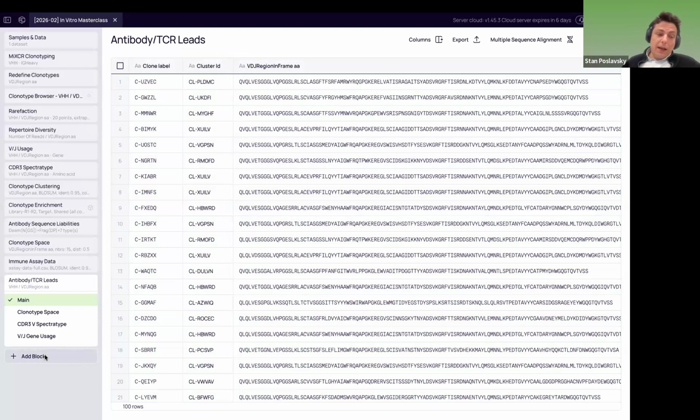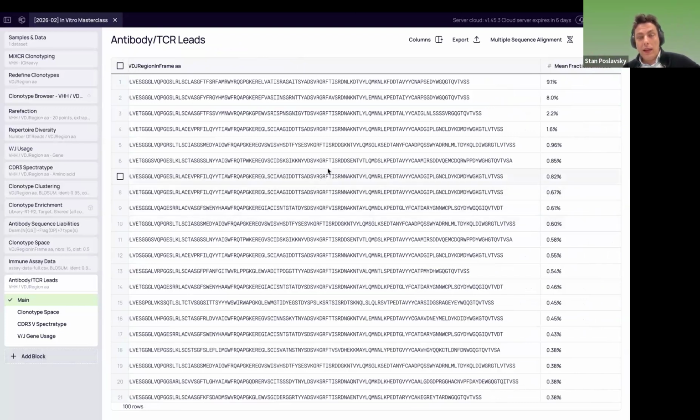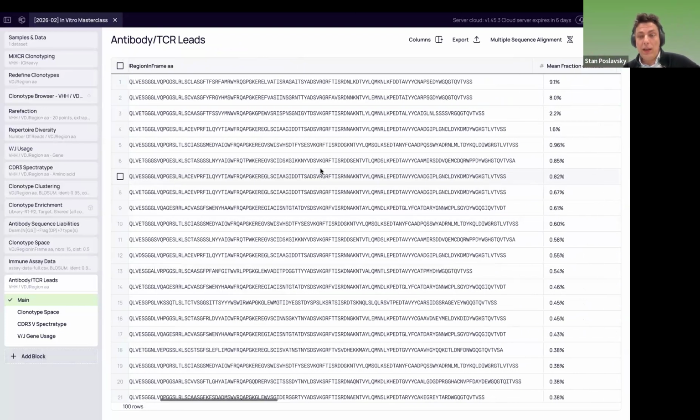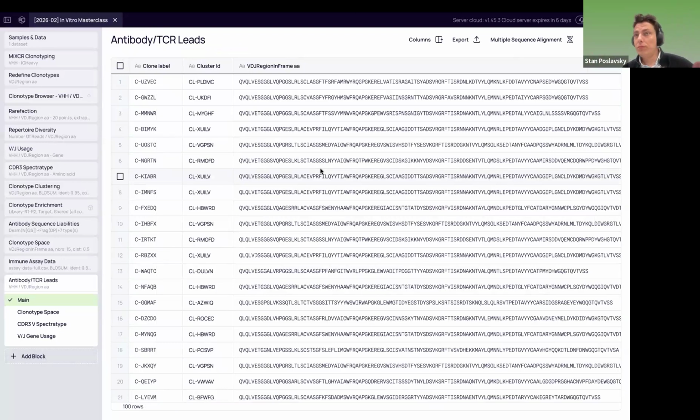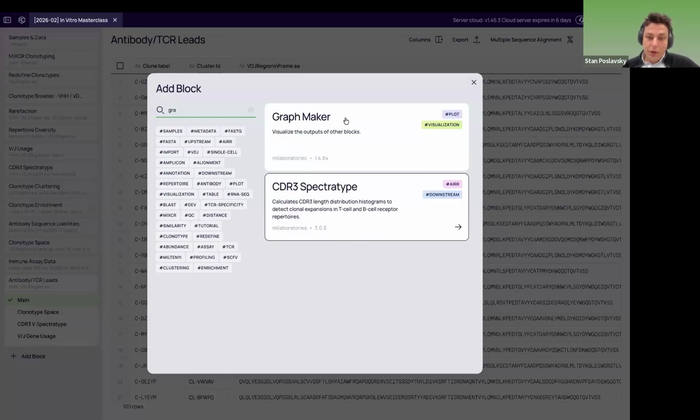But before doing this, let's ask one question. Since we have a negative control, what's the fraction of those highly abundant candidates that we picked with the standard top-N picking that are actually not real binders, but sticky antibodies? That can be done really easily with Platforma. Let me do this live.